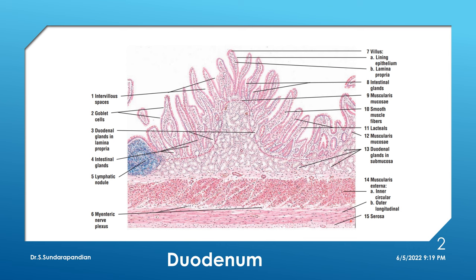The identification point for duodenum is the presence of villi. These are the surface projections of mucosa called villi. In duodenum we have more numbers of villi. Mucosa consists of lining epithelium supported by a layer of connective tissue called lamina propria, then muscularis mucosa.